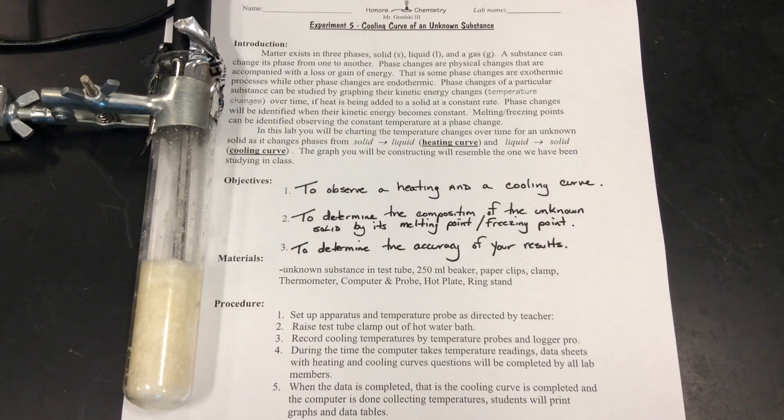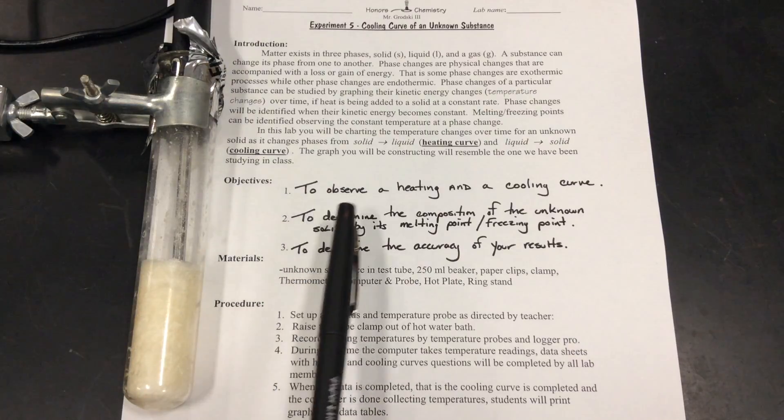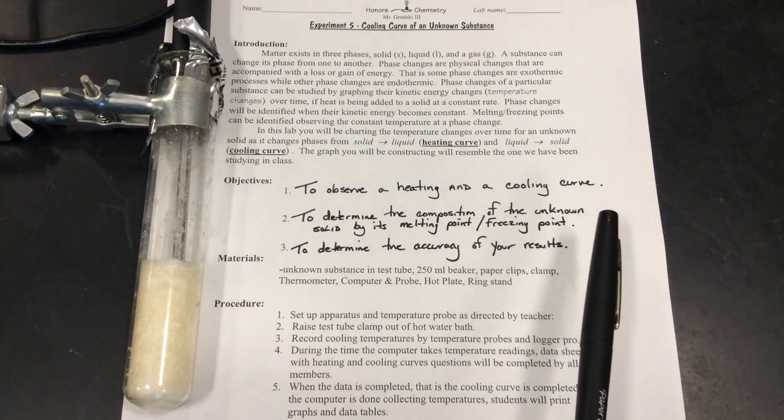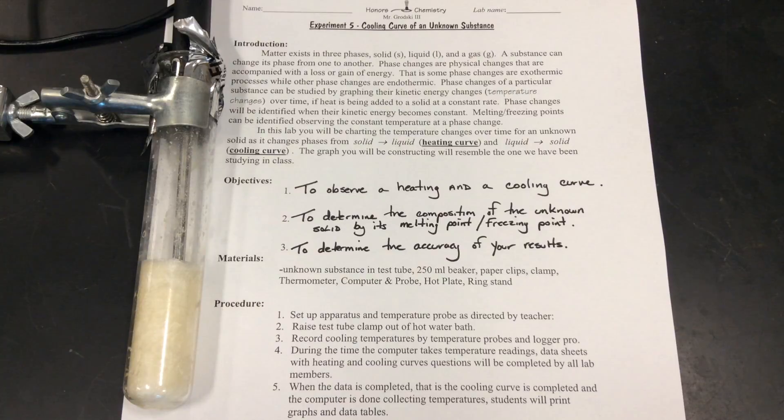If you notice, the first objective is to observe a heating and cooling curve. We're going to take it from a solid to a liquid, pull it out of the hot water bath, and then we're going to go from a liquid to a solid. We're going to skip the gas phase. As we study heating and cooling curves, we're not going to have a gas phase or a phase change beyond that.